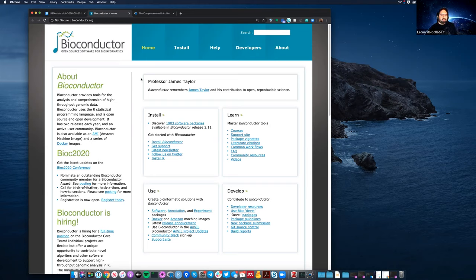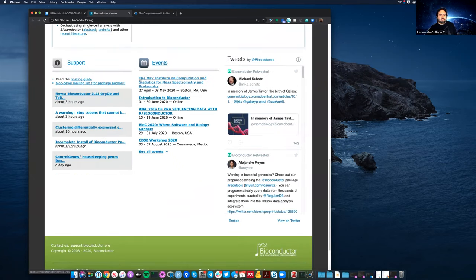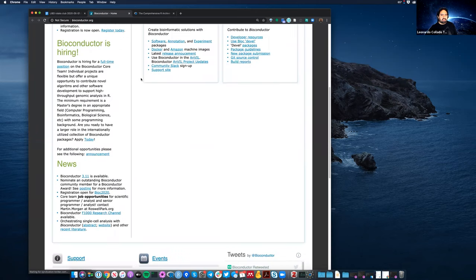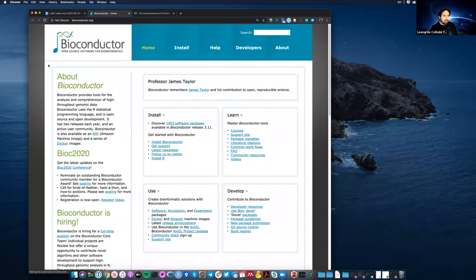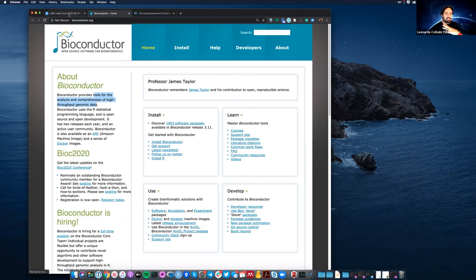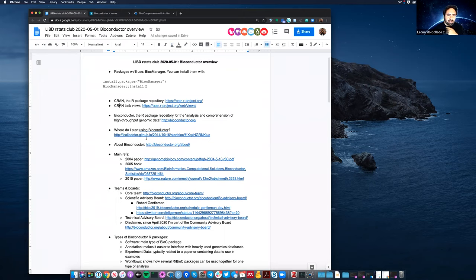The website bioconductor.org has a ton of links and we're not even going to look at all of them. There are many places where you can find information and easily get lost. The short 'About' description says it's tools for analysis and comprehension of high-throughput genomic data. That's why I made a kind of cheat sheet for what we'll be doing today.